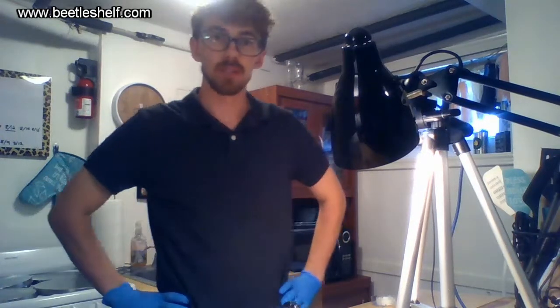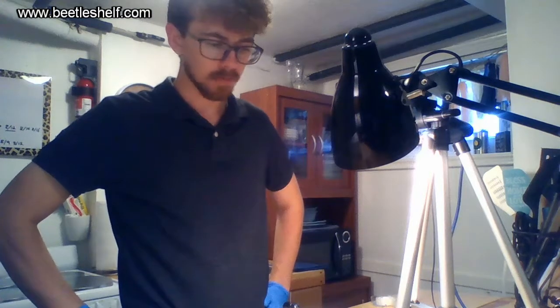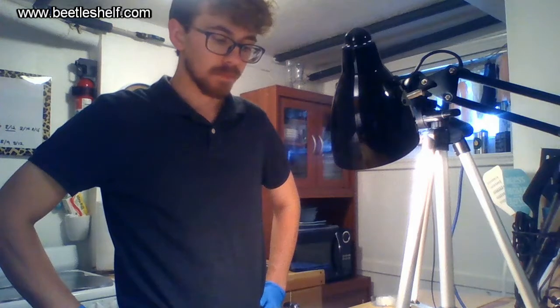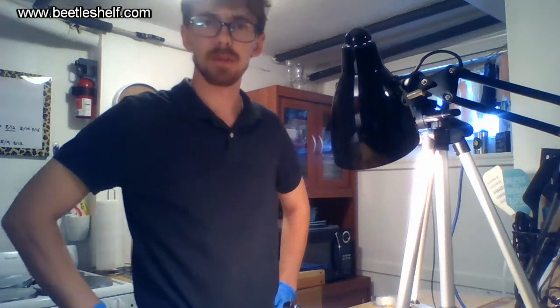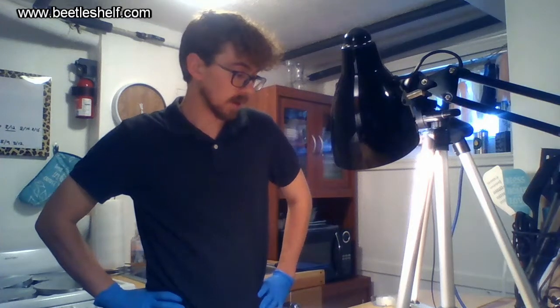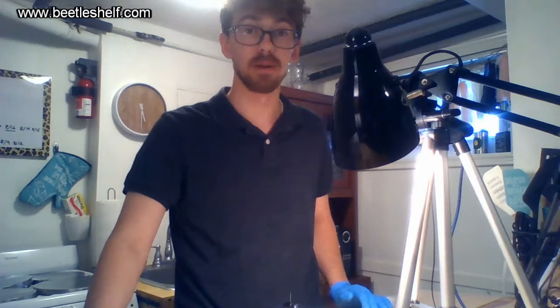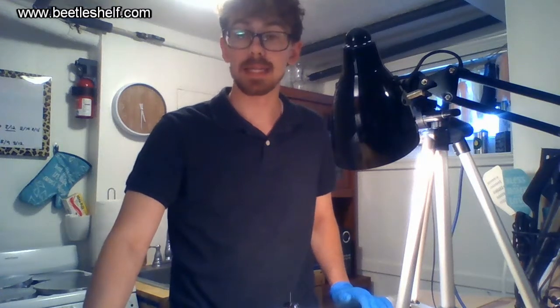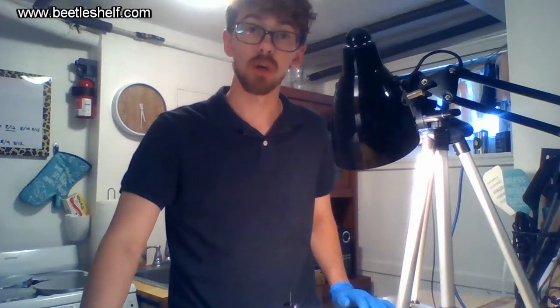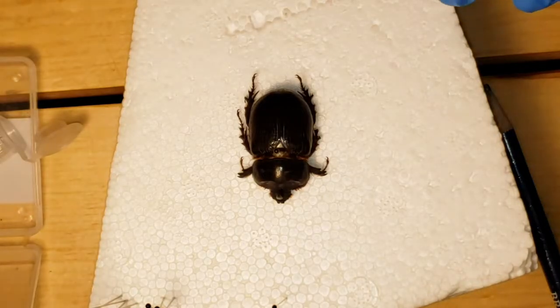Hey guys, welcome back to the Beetle Shelf. Today we got something a bit different set up. I don't normally pin insects because I like to see them alive, but today I got gifted these nice beetles, these nice specimens from my friend who was on a hike in southern Utah. We're going to show them off and pin them today. The specimens we have here are a male-female pair.